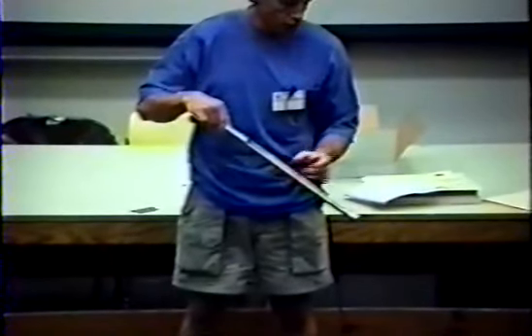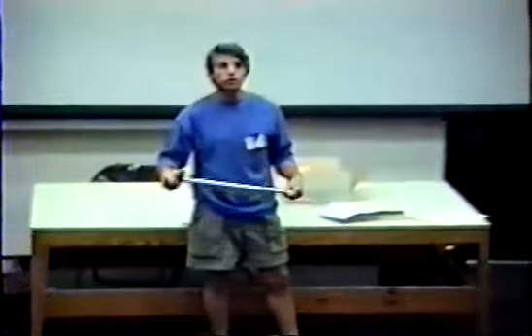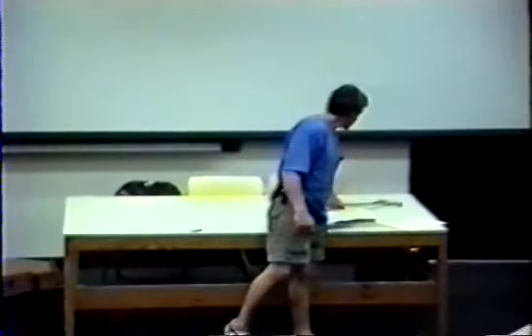quarter to half inch, or up to an inch, depending on how much root system you have in there. Then you take 5 to 7 inches and put that in the pail, and then clean out your plug like this. You want to be careful not to drive this through your shoe because it'll throw your sample way off. Plus, aerating your foot is extremely uncomfortable.